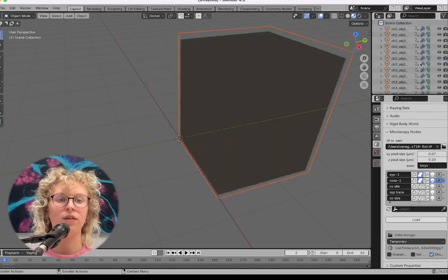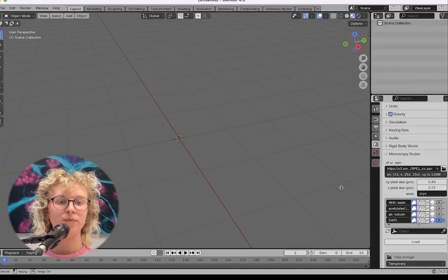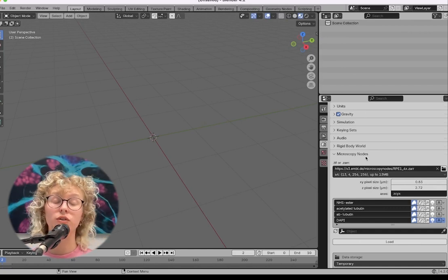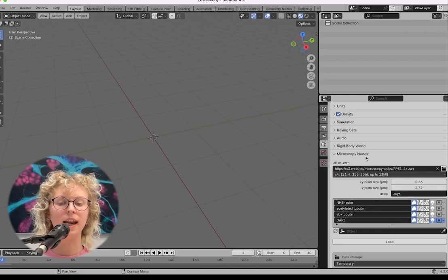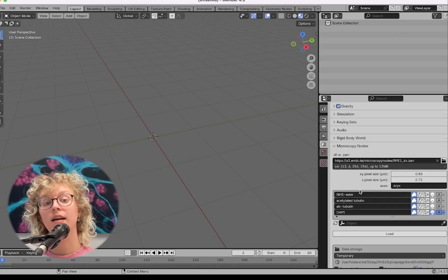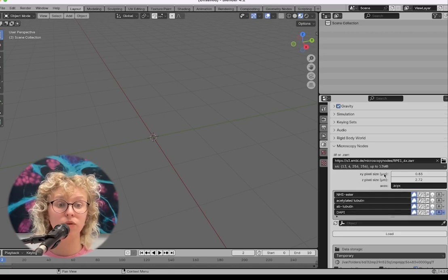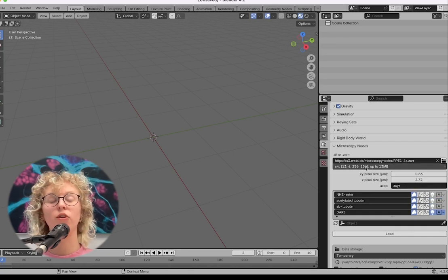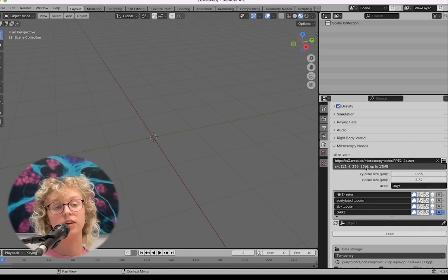So we'll first delete everything in the file. Here we have the URL of an example Zarr that I have online, but you can also use Zarrs from different online databanks. This is an expansion microscopy dataset made by Granita Lokai. And you can see that because it is an OME-Zarr, we have a few extra things. One is that the channel names have been filled in from the file, but also that we can select which size to load the data at, because there are multiple sizes of the Zarr stored with the data, and that it's directly loaded from a URL from online.